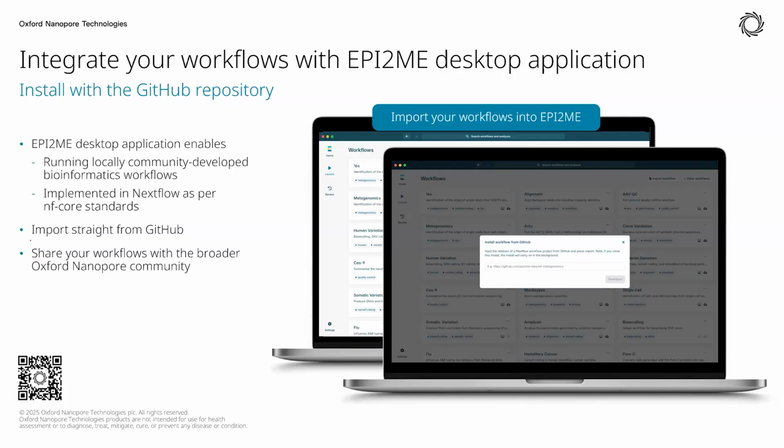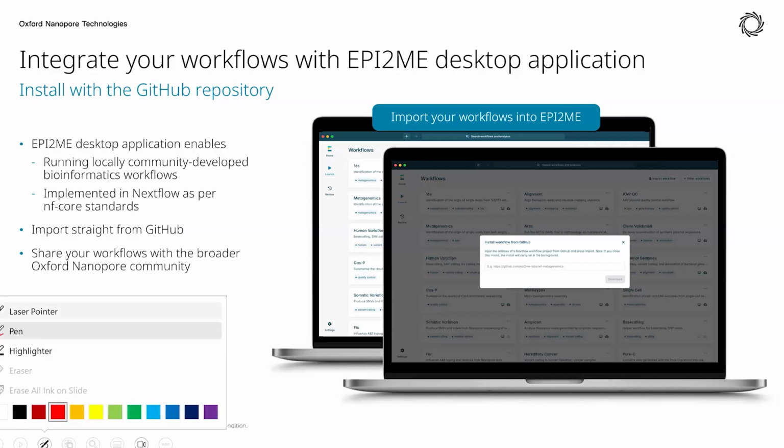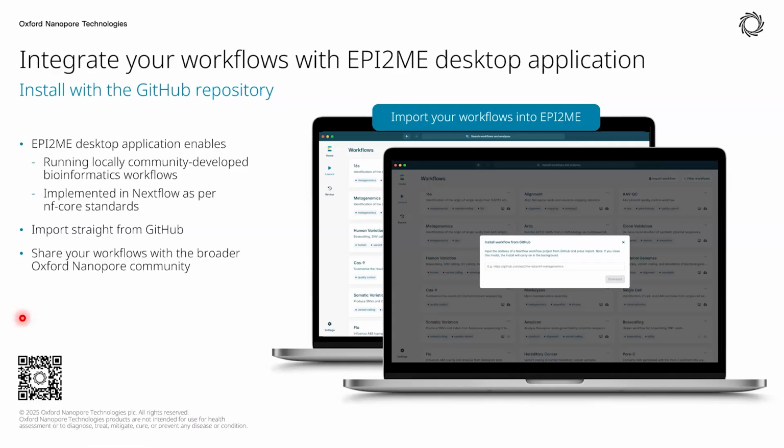But there is a community-developed ARTIC network field bioinformatics pipeline that you can use for different analyses. I believe this one is currently focusing on mpox, but again, it's a pretty open framework, so you can always fork these and add your own customizations or focuses to these workflows.